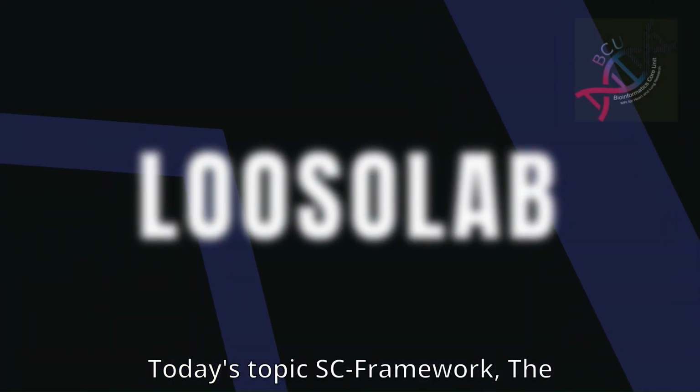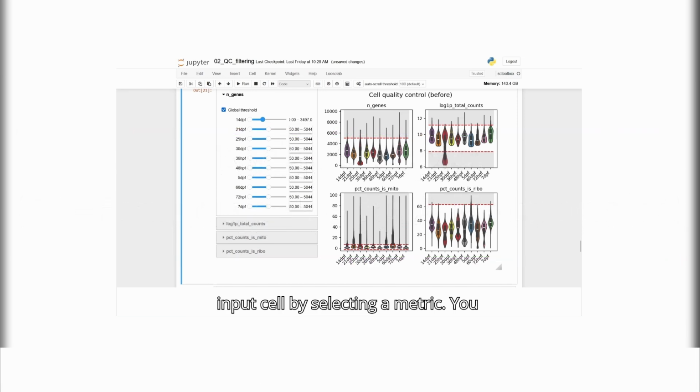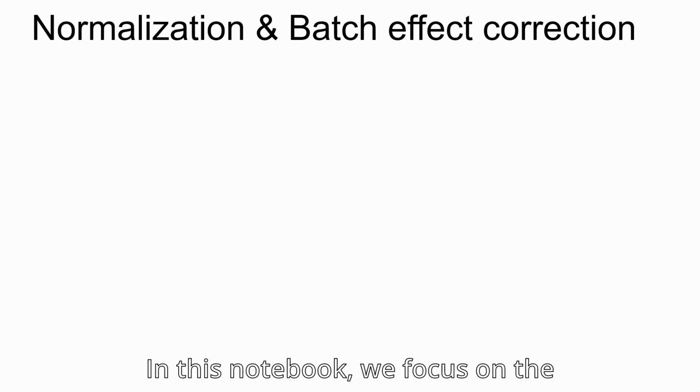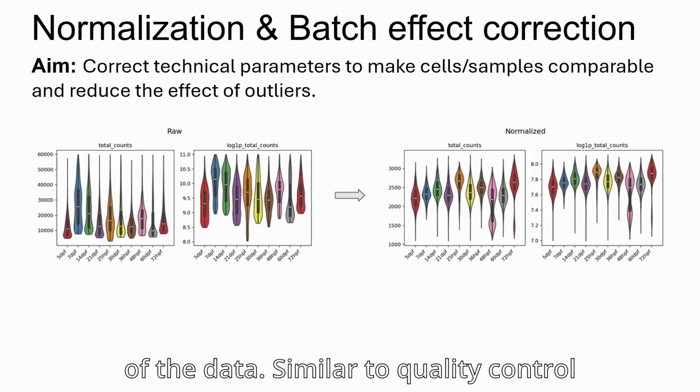Today's topic, SC Framework, the Normalization and Batch Correction Notebook. If you haven't watched the previous videos, we recommend you to go back and watch them first. In this notebook, we focus on the normalization and batch effect correction of the data.